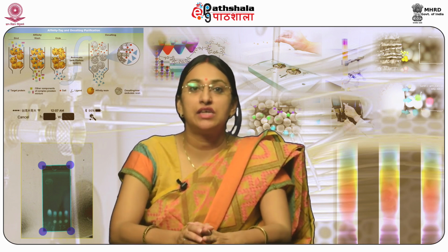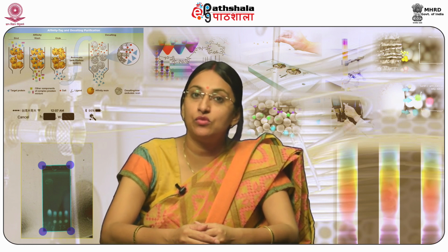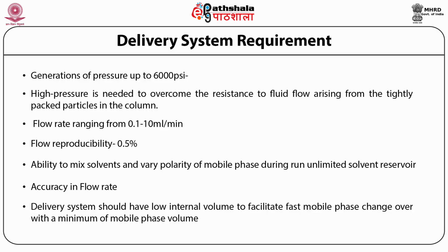This requires the capability to maintain high pressure, high enough to force the solvent through a compactly packed column. Also, if a mixture of two or more solvents is to be used as mobile phase, then the solvent delivery system should be able to mix all solvents together to give appropriate polarity. It should have low internal volume to facilitate fast mobile phase changeover with a minimum of mobile phase volume.